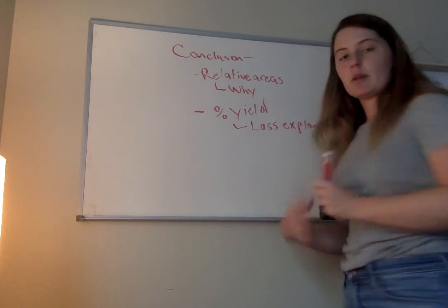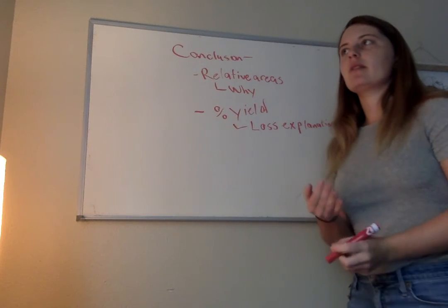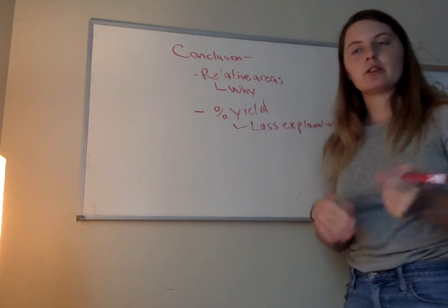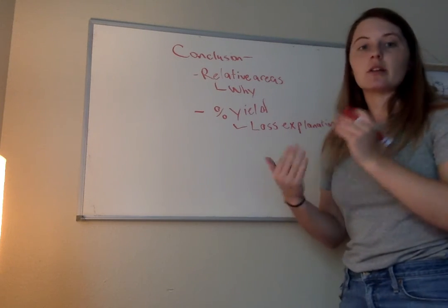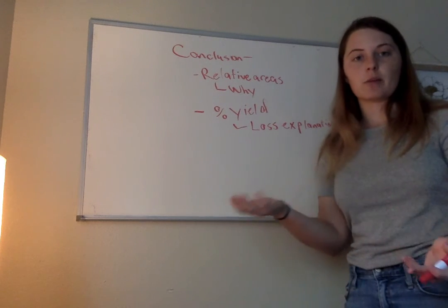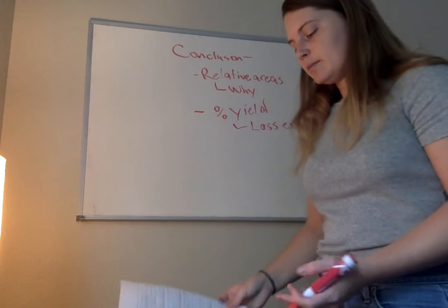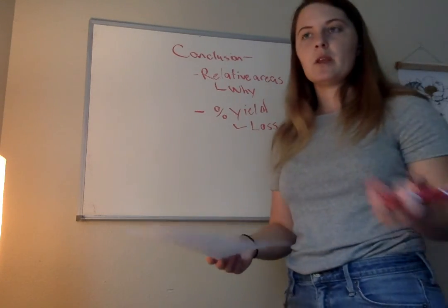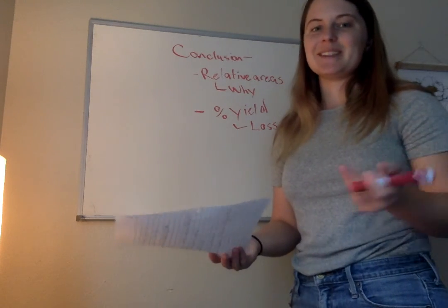I know it's going to be hard because you didn't actually do the experiment to visualize why this happened, but pretty much every time in the lab report there's a warning, something like don't boil it too high, use wool as a fractionating column. All of the times there's a little warning. That's a place where there can be a pitfall in the lab where you can lose yield. So you can just talk about those things based on what you think are the most important factors. And as usual, you're never going to be marked off for bad data. That's just not a great result.